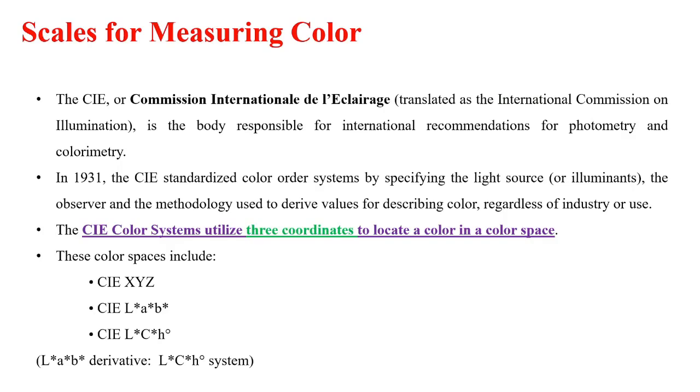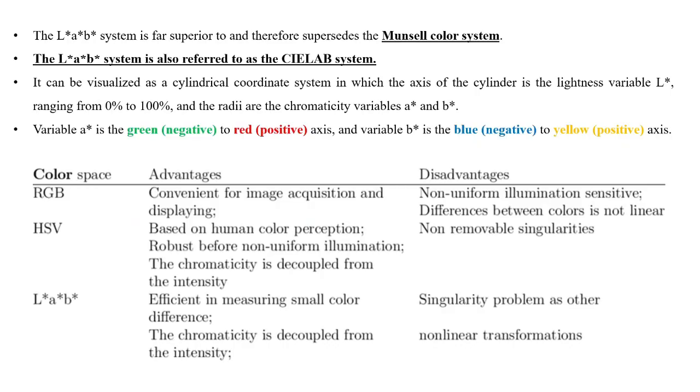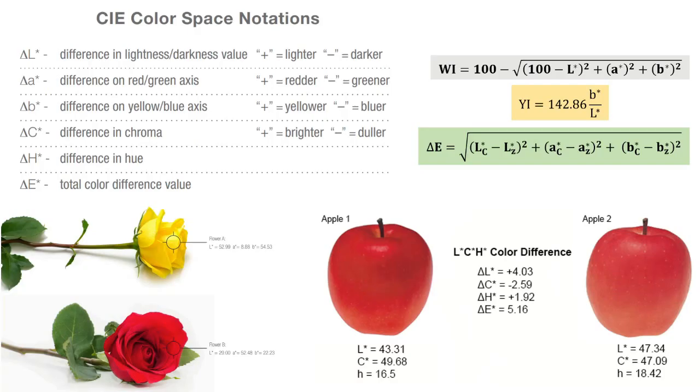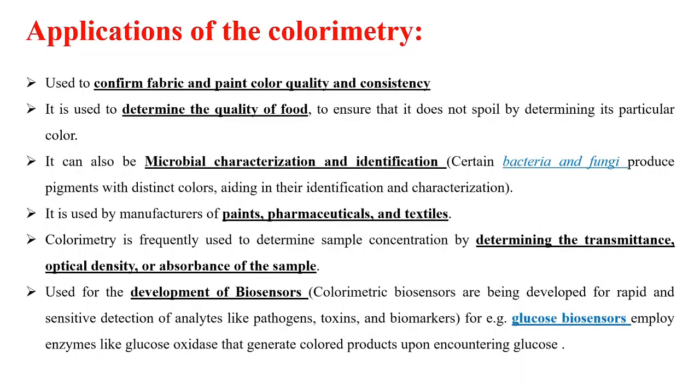I will show you. The device that I am going to show you is a reflective spectrophotometer, okay?